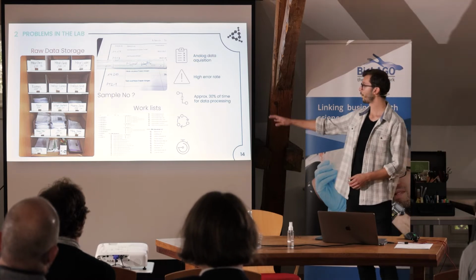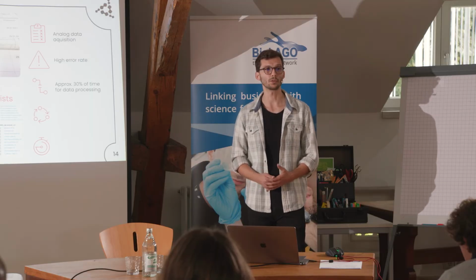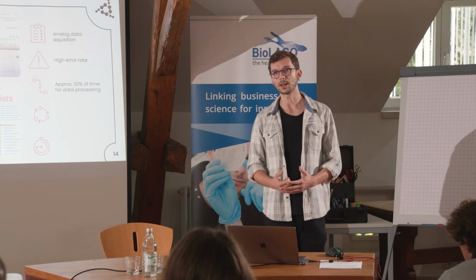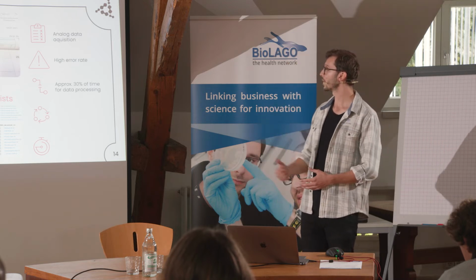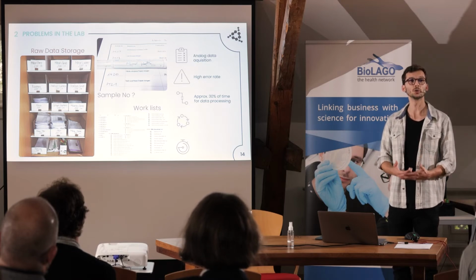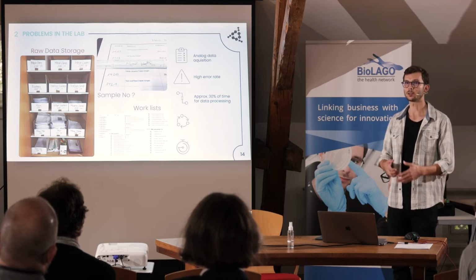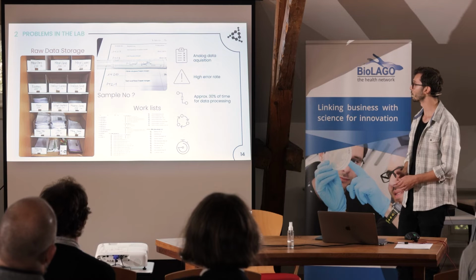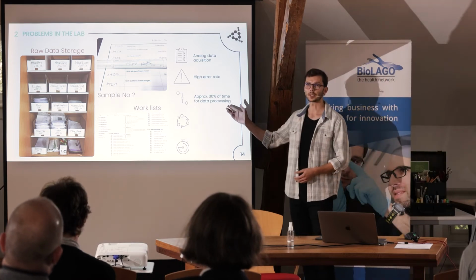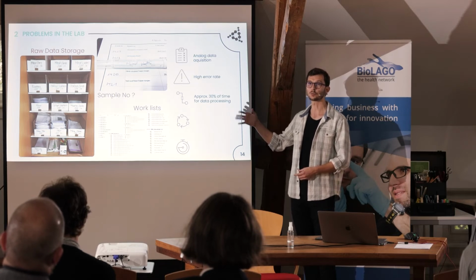One of the most important things is that we can measure the effectiveness of processes and workflows in laboratories. We use Lean Six Sigma tools for that. One of them is multi-moment analysis. And we recognized that a third of the effective time of a laboratory technician is used just for data administration: collecting data, calculating data, doing reports with this data, or even trend analysis. And in industry, a third is a lot of time. If we are talking about money, burned time equals burned money.